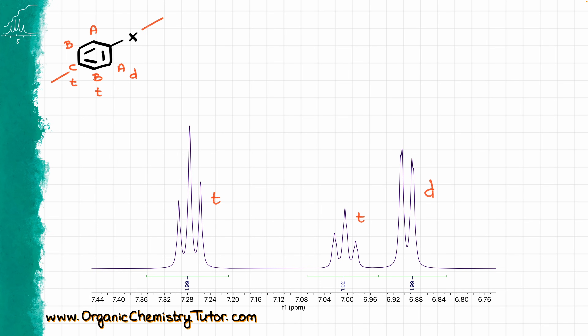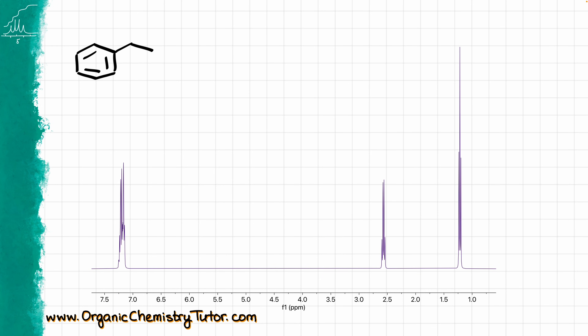However, this nice and clean aromatic region is not always going to look like that. Here is the example of ethylbenzene — and if we look at the aromatic ring, instead of three nice signals, we get a mess. The signals of the aromatic ring are sometimes so similar to each other that instead of a clean three-signal pattern, they overlap and give you either a crazy multiplet or even a big giant singlet of five hydrogens. So whenever you see a massive signal in the aromatic region integrating for five hydrogens, that's just your phenyl ring.